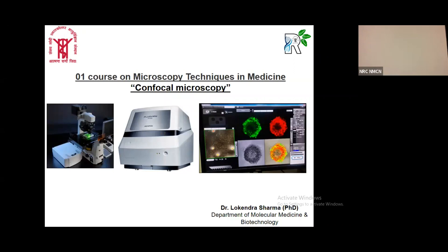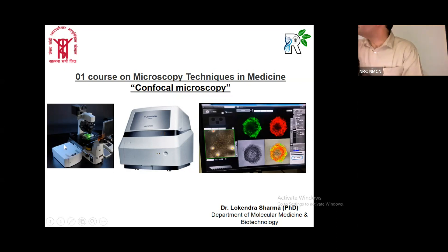This kind of instrument you see generally in a confocal lab. The main core structure is similar to what you see with the fluorescence microscope. The special thing attached to the fluorescence microscope is this light scanning box, which basically has a laser scanning unit as well as a detection system.